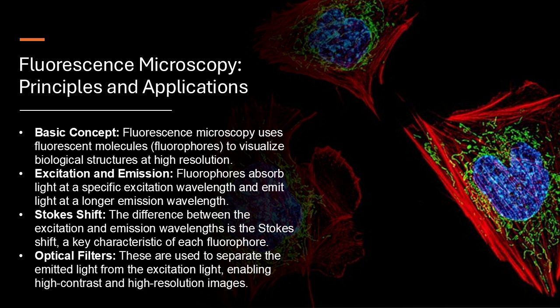Absolutely. And it's not just about seeing smaller. Scientists are also developing new types of fluorescent probes that can sense changes in the cellular environment, like pH or calcium levels. This allows us to study how cells respond to stress signals and other changes in their surroundings. So these probes are like tiny sensors embedded within the cell, reporting back on what's going on inside. Precisely. It's like having a network of informants within the cell, giving us real-time updates on the state of the cellular environment.